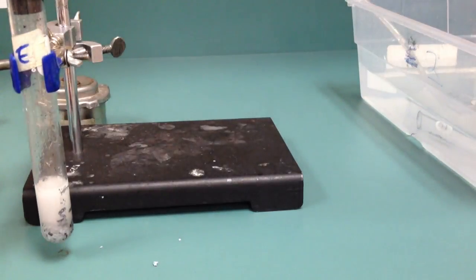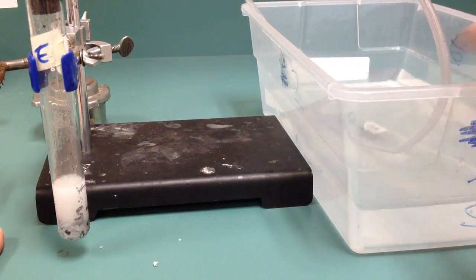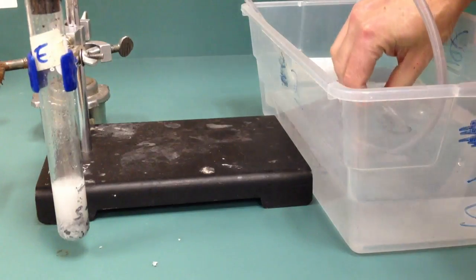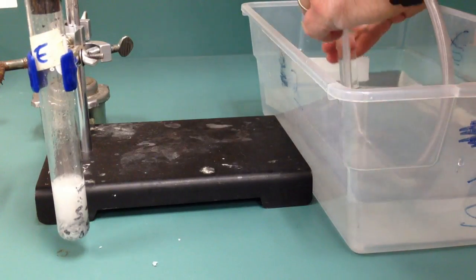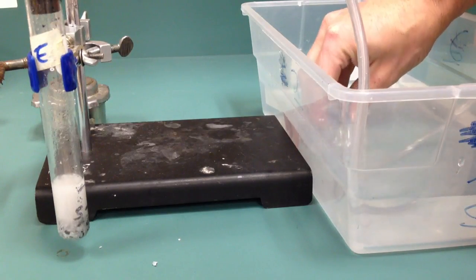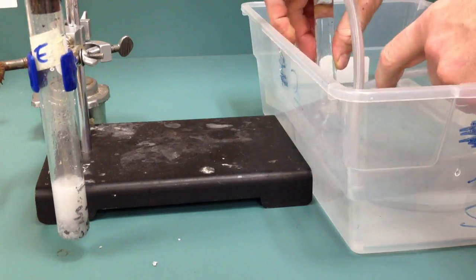I'm going to move this out of the way. And I'm going to bring this into the picture over here. So, what we're going to do is we're going to start trapping some of this hydrogen gas. And the way we're going to do that is I'm going to fill this up with water, like that, and keep it upside down. There we go, in here.